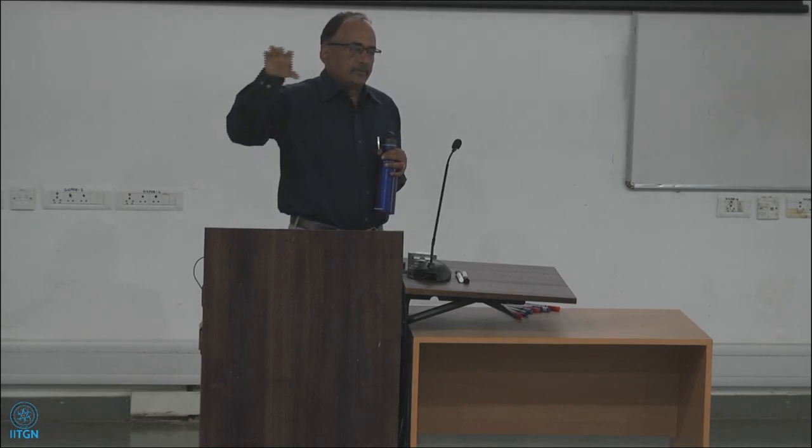Now, the mineralogy. How do we determine the mineralogy? What we do is that we look at the optical properties of these minerals. Primarily, it is mostly dominated by feldspar and quartz. When you look at the Gujarat material, it is feldspar and quartz. Especially when you are looking at materials that are coming from the central Gujarat alluvial plain. It has a mixed nature of geology because the materials that are coming from the Saurashtra area are Deccan trap material, which contain a high amount of augite and feldspar. Then from the Aravalli hills, there is a lot of material coming, which has quartz, mica and all. Then on the eastern side, you have acid and basic intrusives.